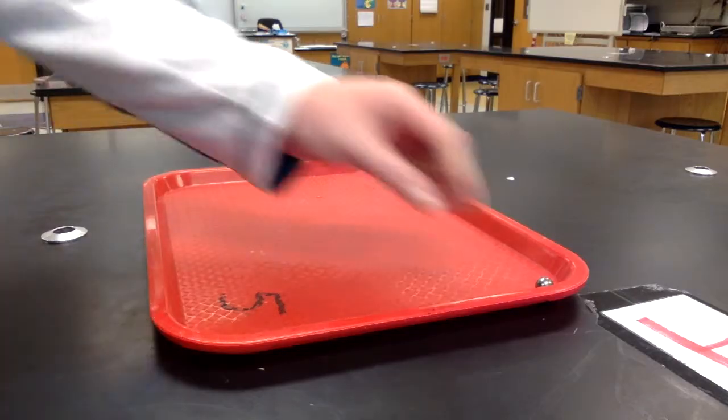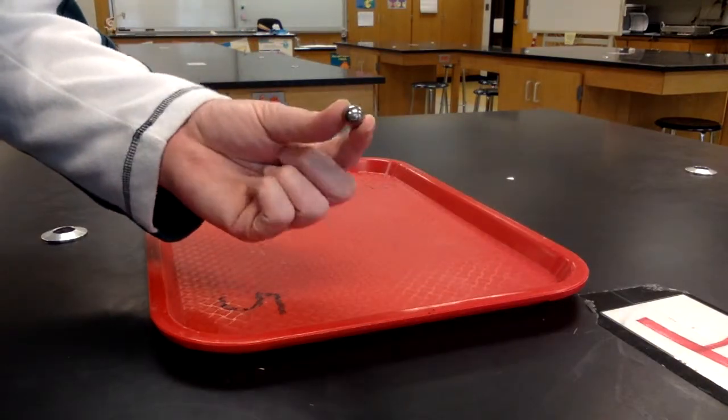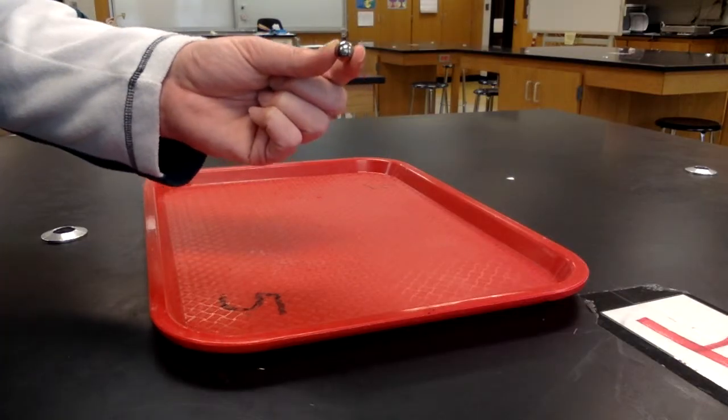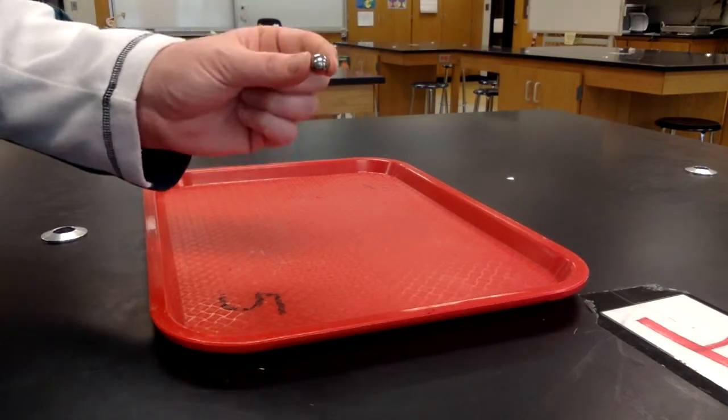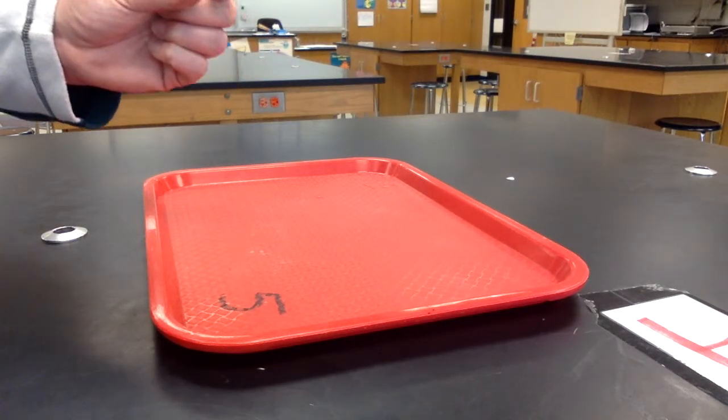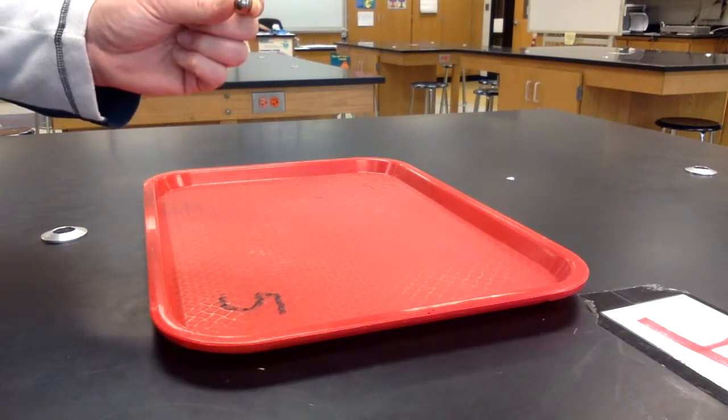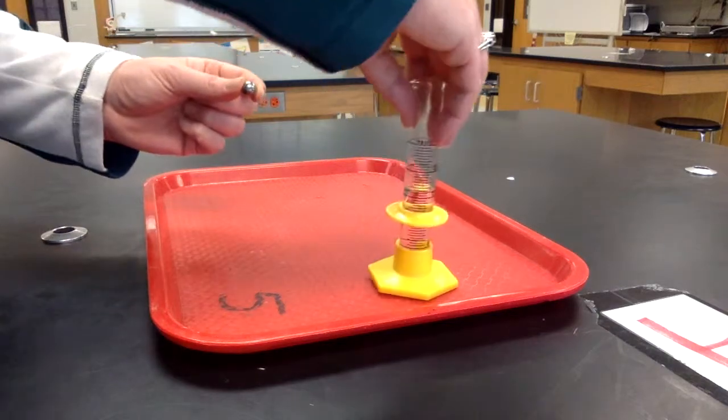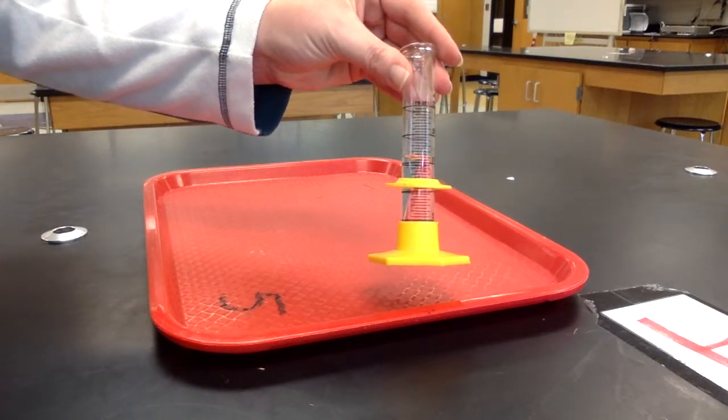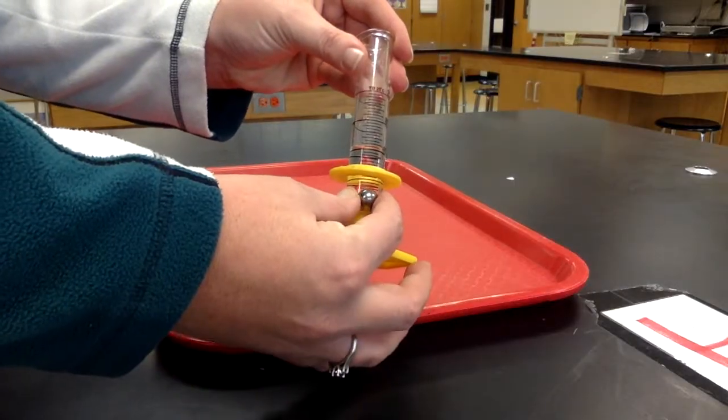To measure the volume of an irregularly shaped object such as a round object or something that does not have the shape of a cube, a square, or a rectangle, I would first take a graduated cylinder. I need to make sure there is enough water in the graduated cylinder to cover the object, which there is.